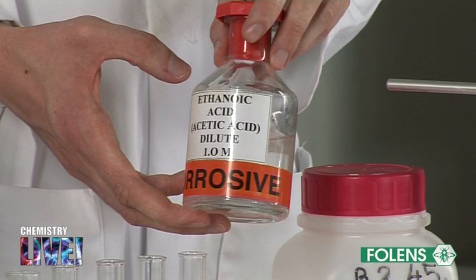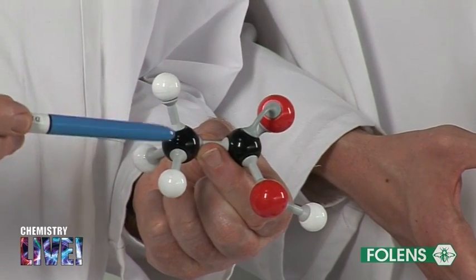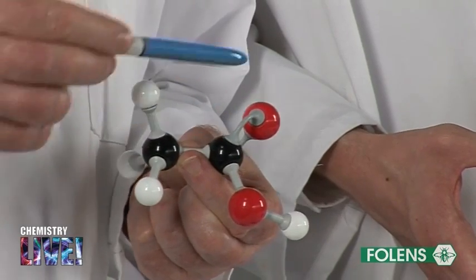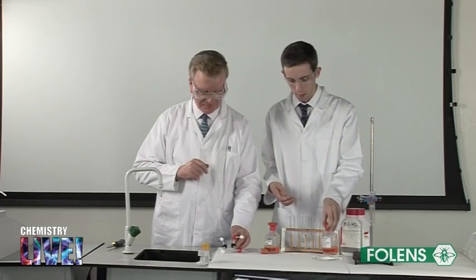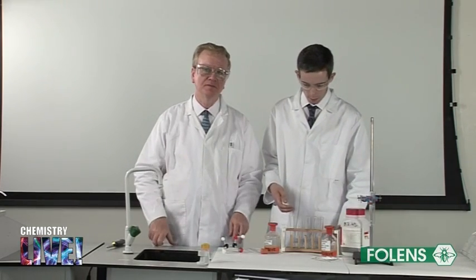Ethanoic acid is a far weaker acid than the common inorganic acids such as sulphuric acid, hydrochloric acid and nitric acid, however it is strong enough to show some typical properties of acids.